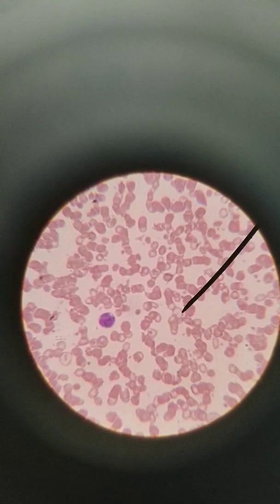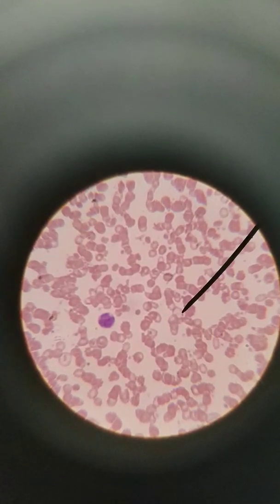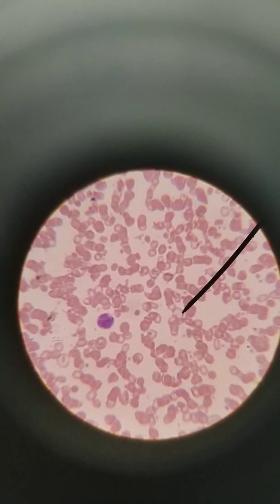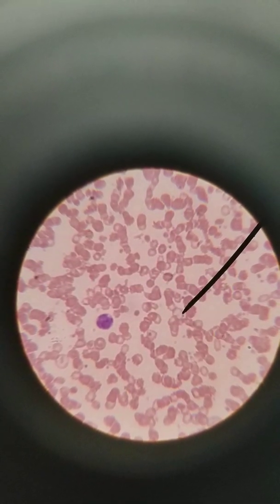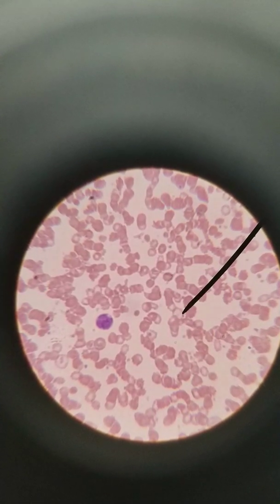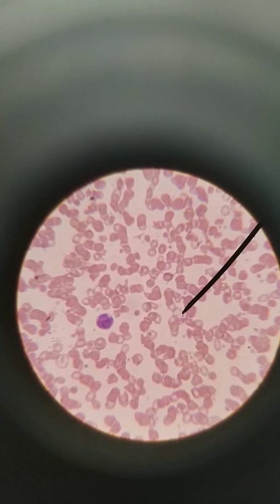The term for this is, since it's smaller, it's microcytic, and because it has a larger white space, it's hypochromic. Microcytic, hypochromic. That's what these erythrocytes are called. What makes a cell smaller than normal?